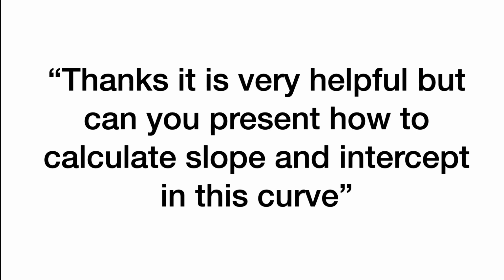Now, in some of my other videos I've shown how to calculate the size of an unknown protein or DNA band on a gel. And in those videos I just say, and then I calculate m and I calculate c, and I've never really explained it. So this video is an attempt to explain how I derive m and c so I can then determine the size of the unknown band.